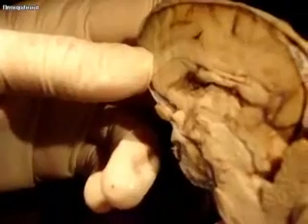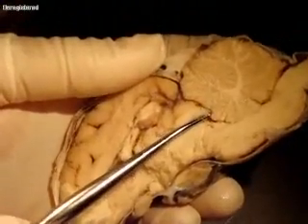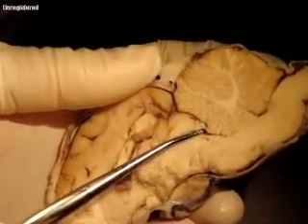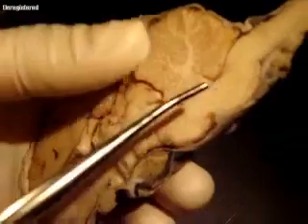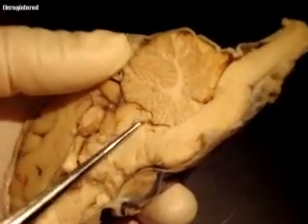Anything else? Central aqueduct? The central aqueduct connects the third ventricle to the fourth ventricle. Its cerebral aqueduct is right here, and then the central canal continues from that. But this is the cerebral aqueduct right here.